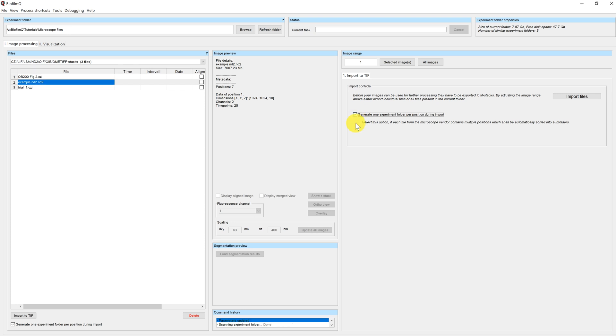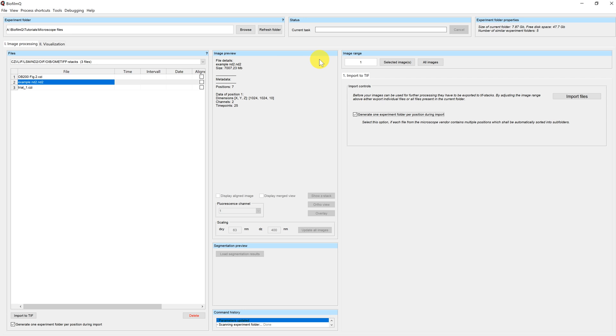Now, if you want to not import all of the images at once, you can adapt the image range up here. The image range tells you which of the files in the file list are going to be processed. So in this case, I only want the second file, and since I have selected it, by clicking on selected images, the file range is automatically adapted.